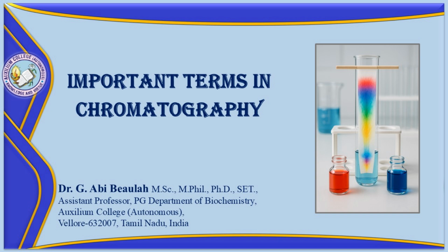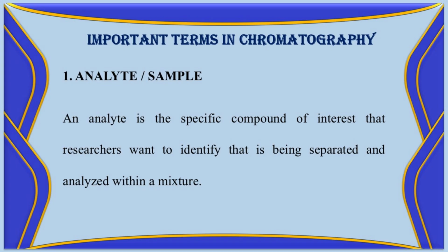In this video session, we are going to see about the important terms in chromatography. The first one is analyte. An analyte is the specific component or compound of interest that researchers or analysts want to identify, that is being separated and analyzed within a mixture.